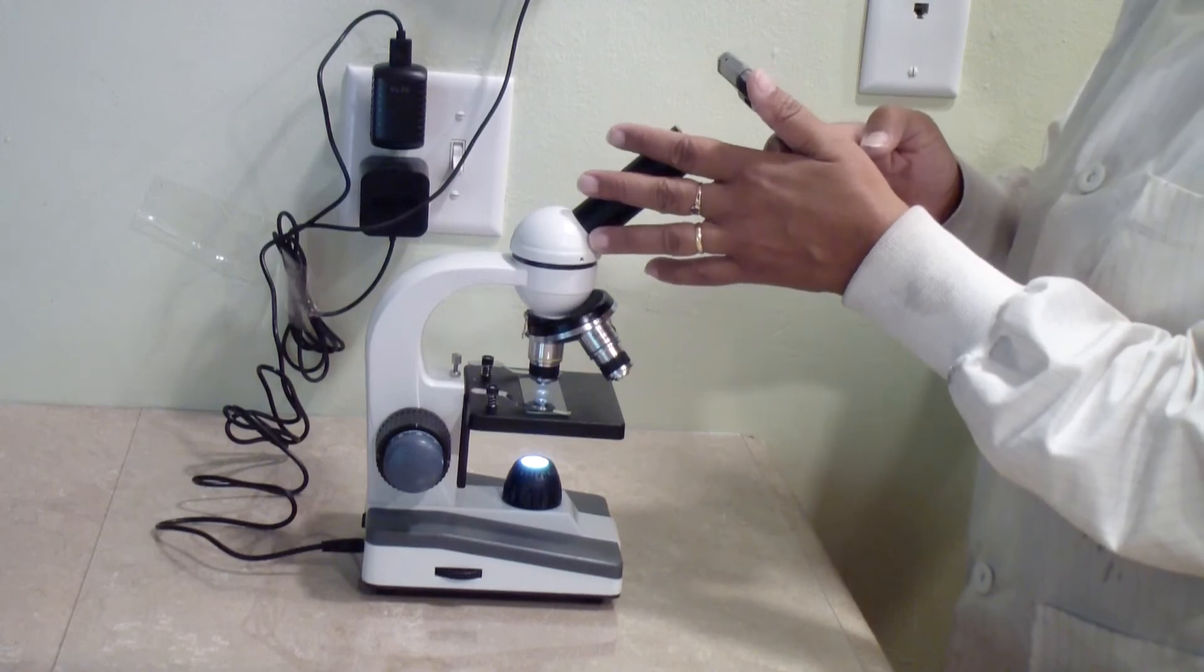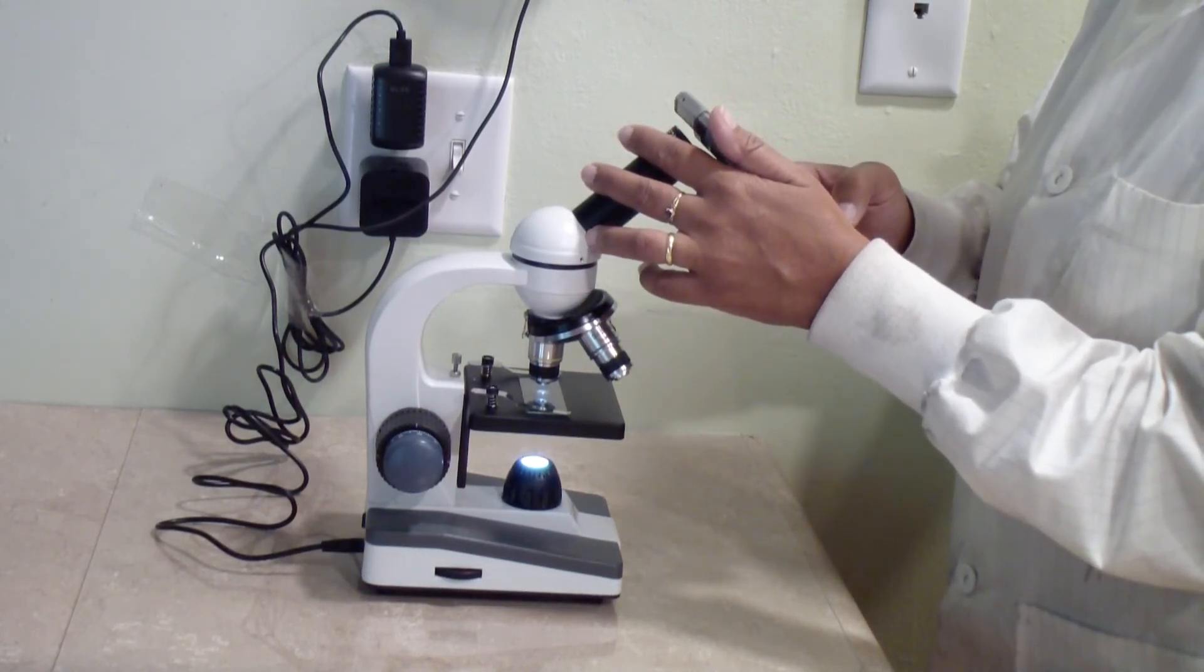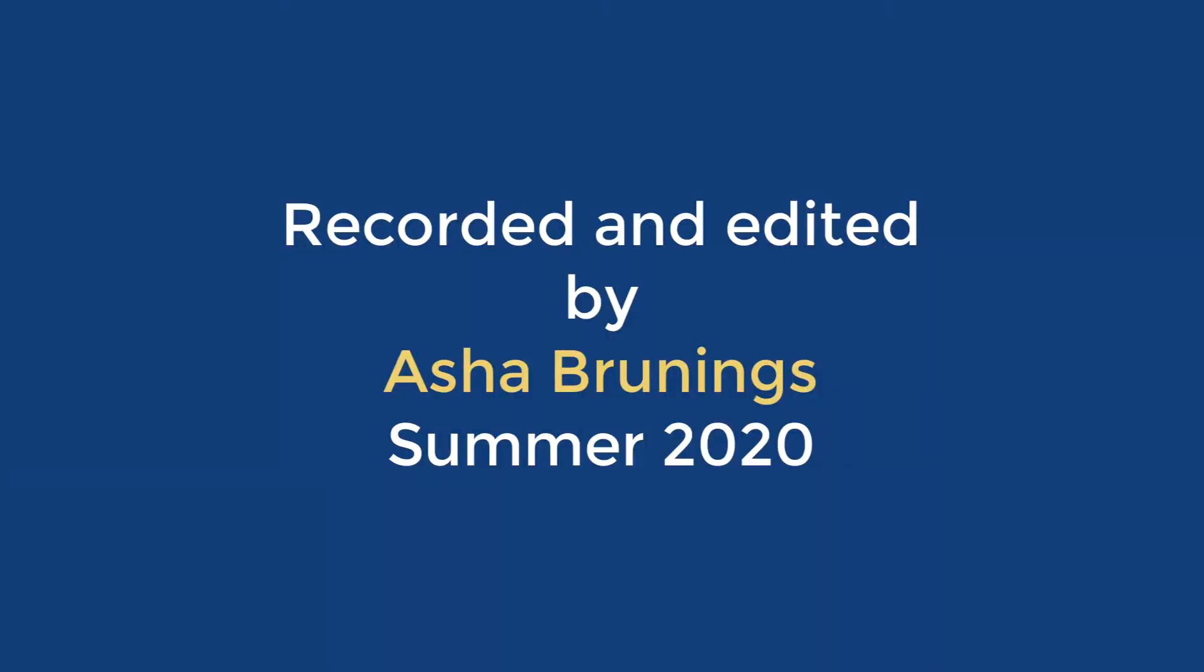Practice taking pictures through the microscope. A separate demonstration video shows how to do that.